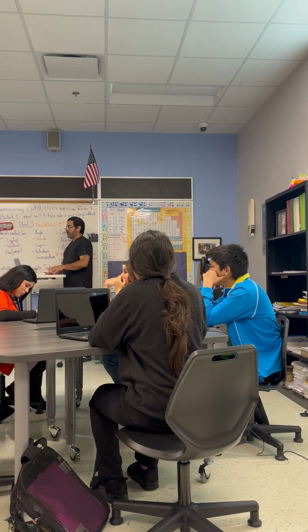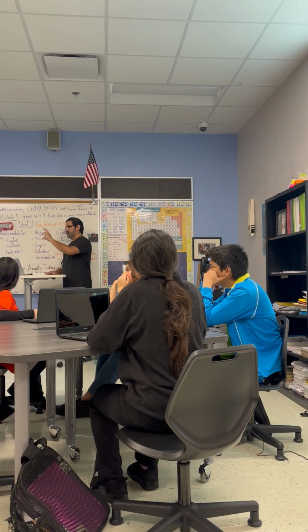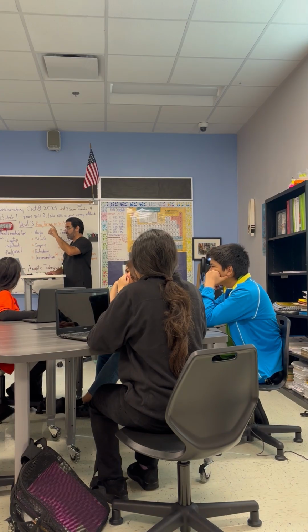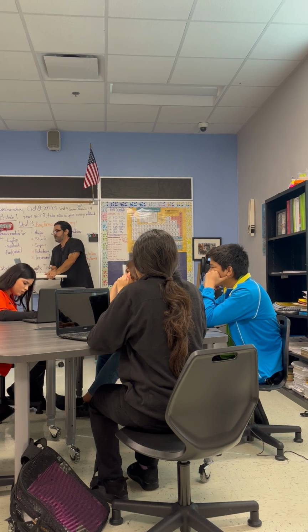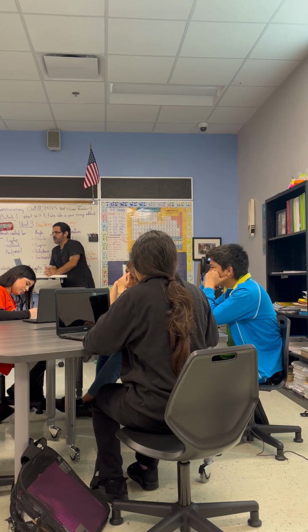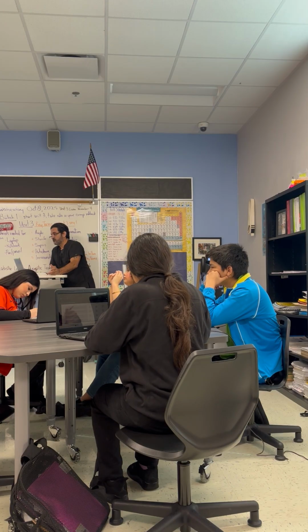because it's very easy. One of the things I noticed in one of the other labs that we did, there was a beaker full of a liquid. It was a clear liquid, but it hadn't been properly labeled. So just imagine, if you're using something that you don't know what it is, would you be at risk of, I guess, not only harming yourself, but also ruining the experiment? So just imagine, the food that you buy, the drinks, everything, if it wasn't labeled, you're running the risk of ingesting something that's going to hurt you, right?